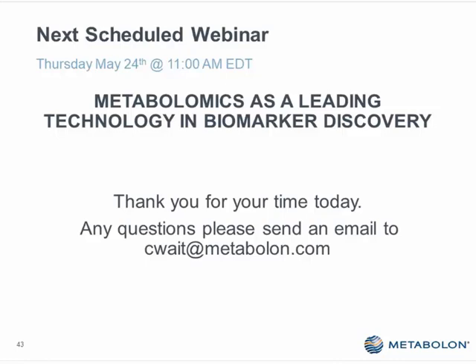So many of these we're having to synthesize because these are not chemical standards. One of the things I tried to point out in the talk is that a lot of the molecules that we're identifying, that we've been measuring over time, are coming from bacterial metabolites. There's very limited information chemically that they really exist metabolically, but also there are no chemical standards. That's really what I meant by, I think, a lot of the future of this microbiome space is not just in how important measuring these molecules is going to be in understanding the bacterial populations, but also that this is probably a right area for discovering new biochemistry that exists.